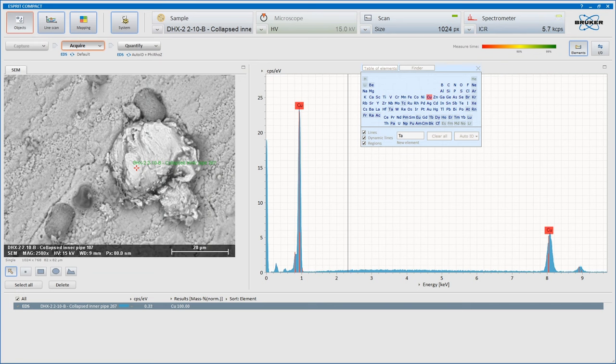Look at that. Almost nothing else. No phosphorus. A bit of carbon and a bit of oxygen. Carbon oxygen, that's it. Wow.